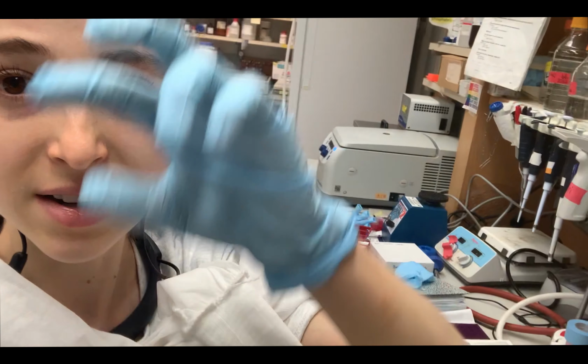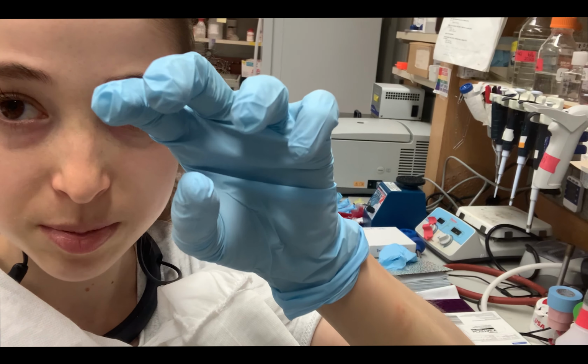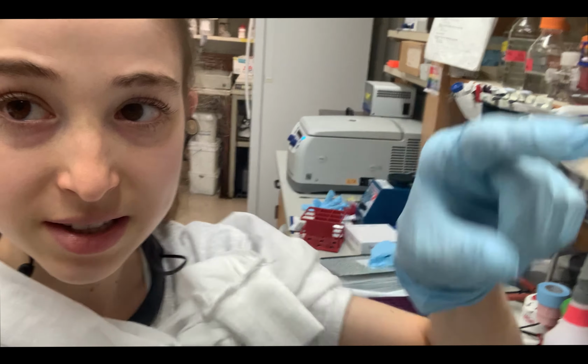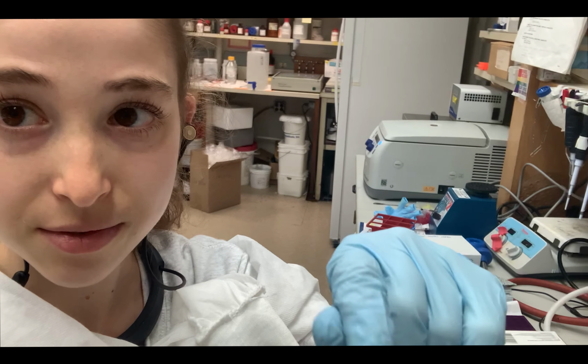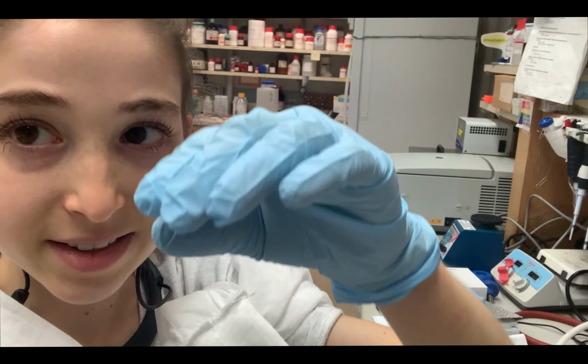Anyway, how it works is that we use ATP, adenosine triphosphate, so three phosphate groups, and the last one, the gamma one, is the one that's going to get transferred. We use ATP that's gamma P32, so that last phosphate, the one that gets transferred, is radioactive. Then you add the kinase with the hot ATP, where hot is just slang for radioactive, and cold ATP, because you don't want it to be super duper hot. If it was all hot, you don't want that. So it's just a little hot.